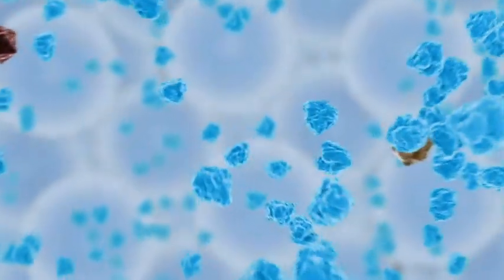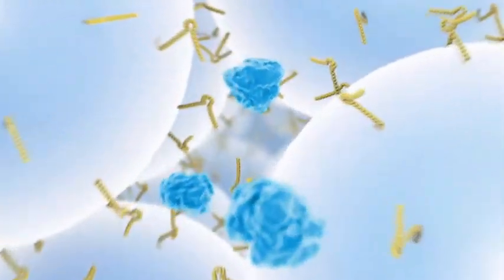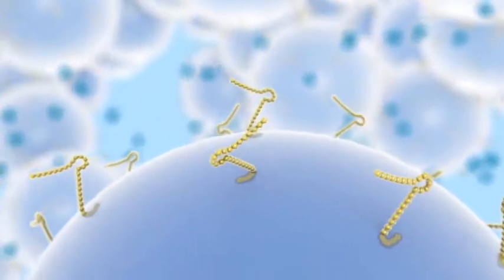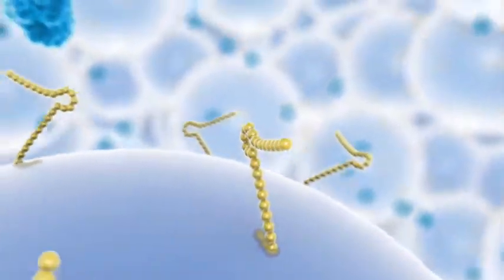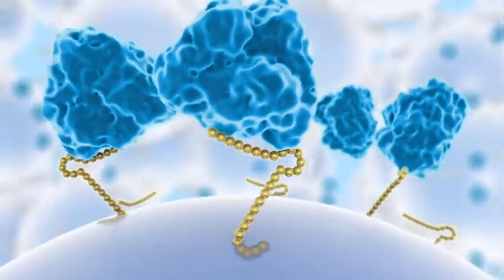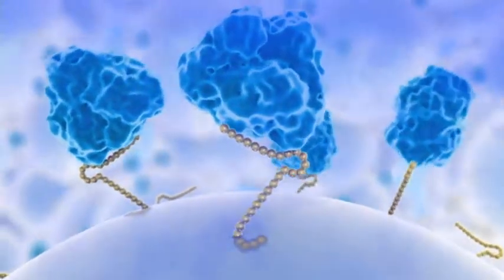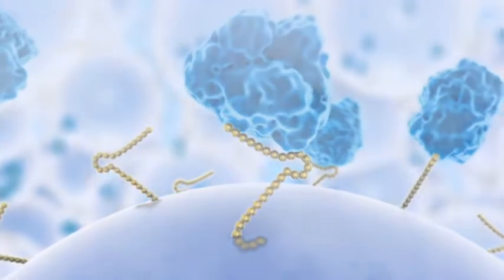Wyeth replaces the murine monoclonal antibody with a synthetic ligand in its affinity chromatography step. The synthetic affinity ligand is a patented 27 amino acid polypeptide that selectively binds to the recombinant factor 8 molecules so they can be cleansed. The synthetic ligand is designed to eliminate the potential risk of murine viral contamination.